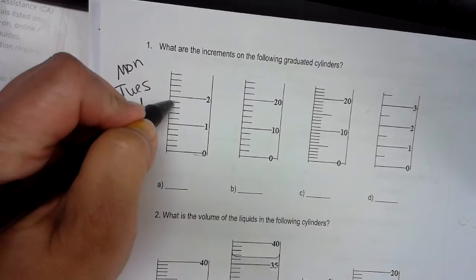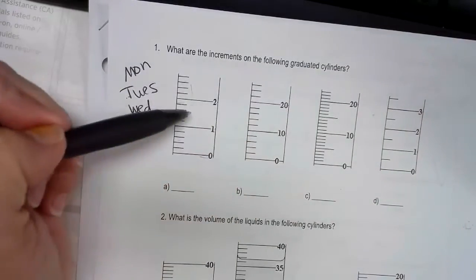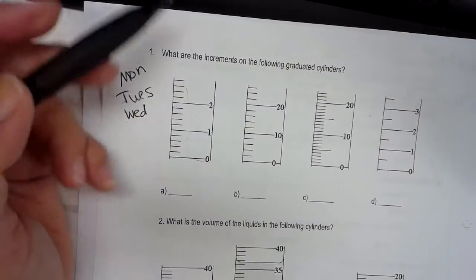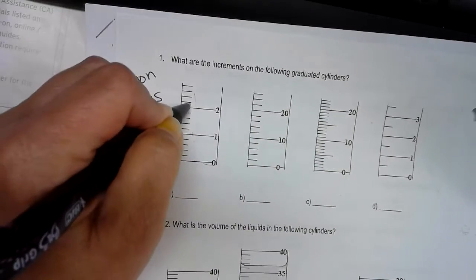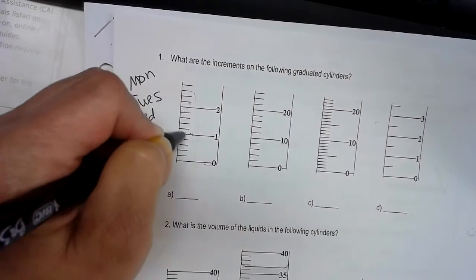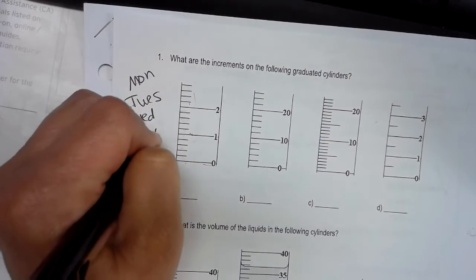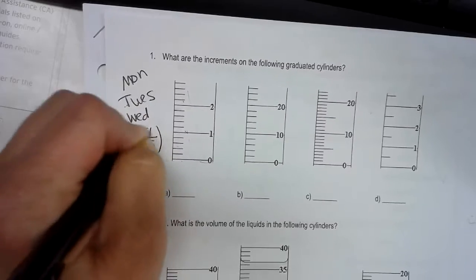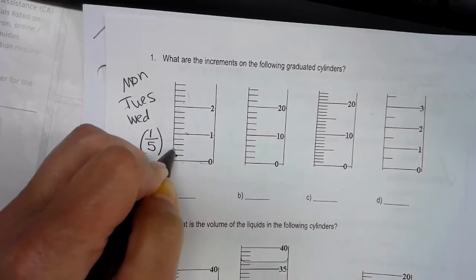If you look here, you have spaces, and this is usually volume. You could also do this with a thermometer, a type of liquid alcohol thermometer. Here you have 5 lines between 0 and 1, and between 1 and 2. So it's like you have 5 divisions for 1 mL. You're going to put the 1 mL divided by 5 lines. It's like saying, what is 1/5? And 1/5 means every increment is going to be 0.2.